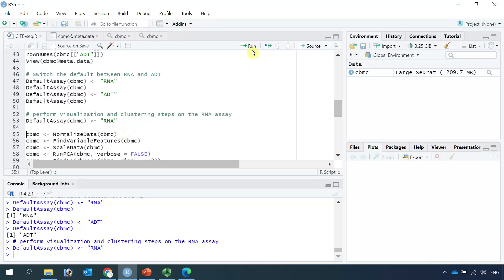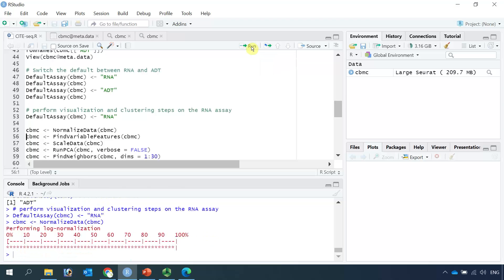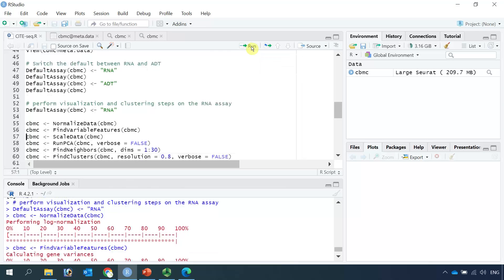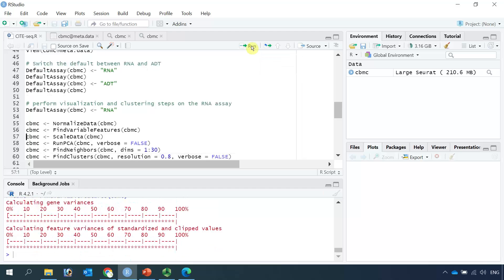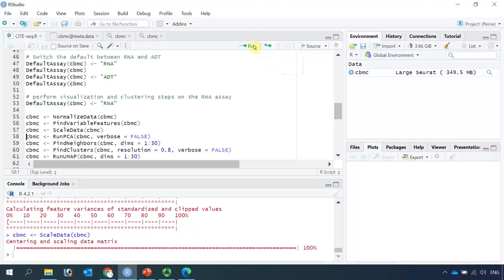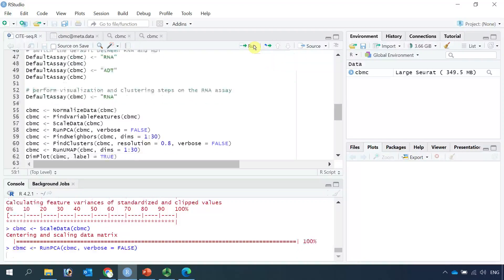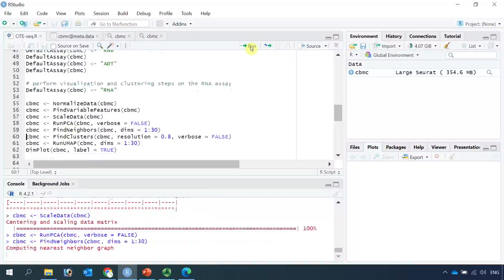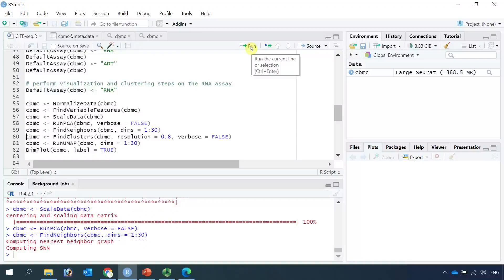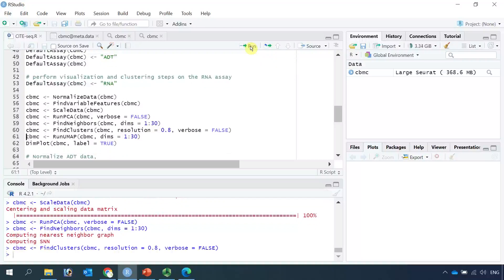First, we normalize the data. Then we find the variable features. Then we scale the data. Then we run PCA. After PCA, we find the neighbors and find the clusters. Finally, we run UMAP.